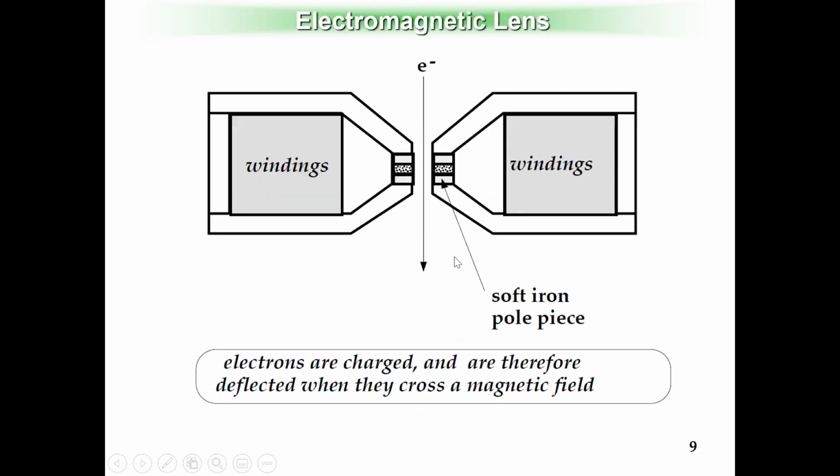And this is a little schematic of the electromagnetic lens. Like I said, it's very similar to the light, like those convex lenses, right? The only difference is that they use an electromagnetic field. It is labeled here like the soft iron. It can be copper. When it's wound together and you flow a current, you will generate an electromagnetic field.